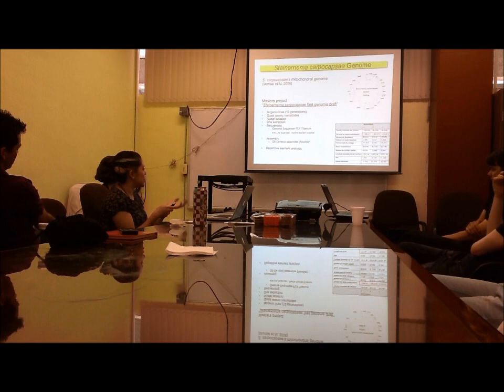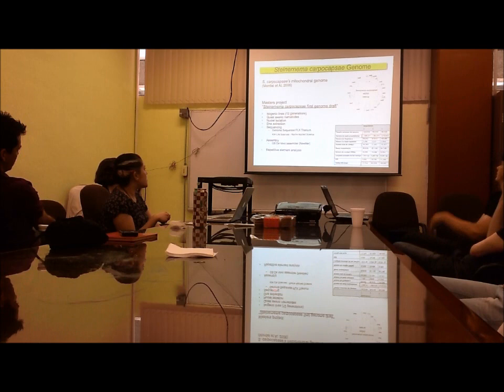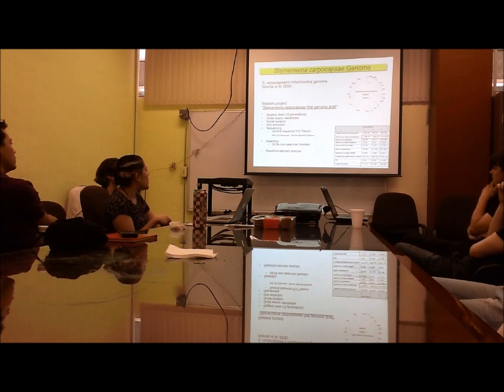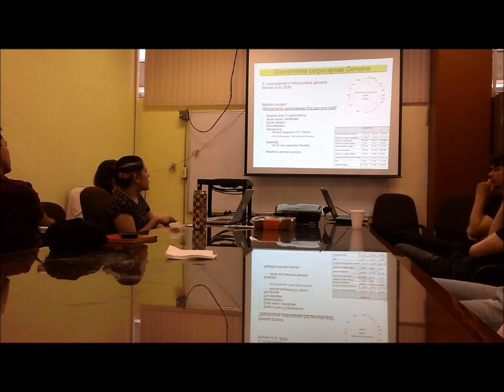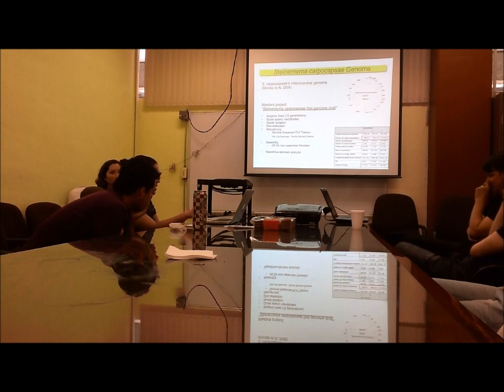And then we worked on the DNA extraction in order to get a high yield of DNA. And then we sequence, mainly with 454, and then I assemble with the Newbler software that comes with 454, and I looked for repetitive elements. And we got three runs during my master's, and so I started just showing the different samples I did. And I finished there, because I have finished.